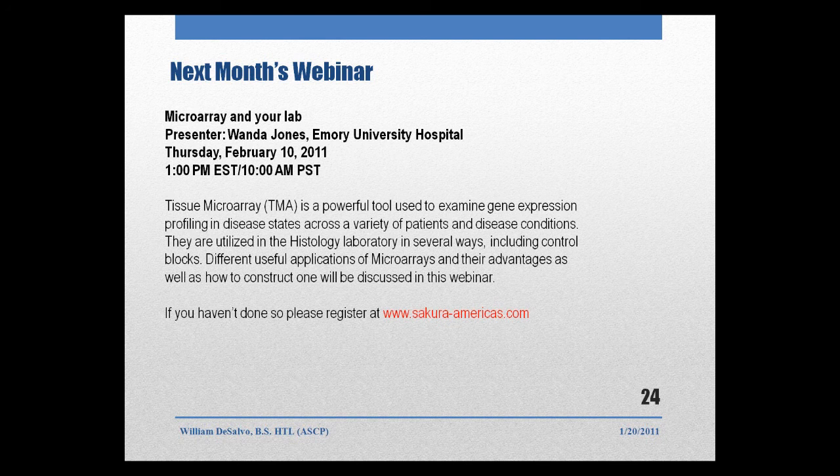The question is, do you have any suggested resources specifically for QMS in histology? Well, the first step is you have to go out and find that method. There are many books, many things on the internet, maybe even in your own institution. If you have a quality management department in your institution, I would imagine that someone already has access to or is participating in Six Sigma or Lean. So if you're in a larger institution, I will tell you to look within your institution. We're one of the last areas that are trying to move into quality management, but many other areas, especially in the hospital, nursing, surgery, even the clinical lab, have embraced and moved into quality management processes and systems. So that's one place.